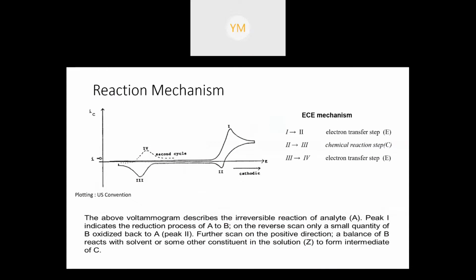Okay, we look at this reaction mechanism. There is one cyclic voltammogram. The above voltammogram describes the irreversible reaction of A.